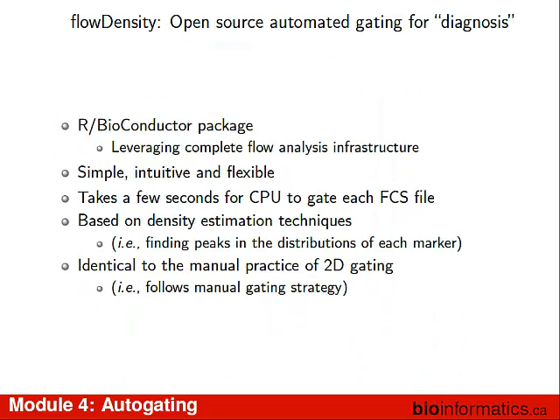So the flip side of that, I think that works. I'm pretty much willing to guarantee that's going to work on your data if you're doing that kind of thing. If it doesn't, let us know. That goes for everything. If stuff doesn't work, let the people know, because that's how things improve. I'm even more excited about flowDensity because people want to do that more. So okay, we can do that.